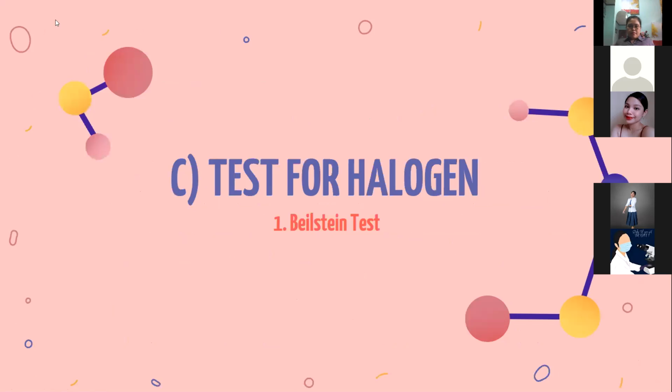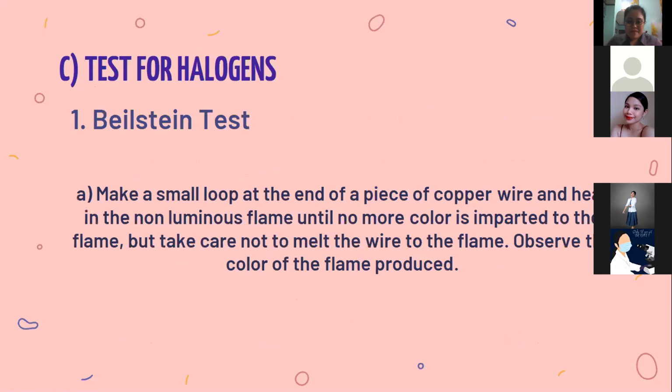Test for halogen. First is the Beilstein test. Make a small loop at the end of a piece of copper wire and heat in the non-luminous flame until no more color is imparted to the flame. But take care not to melt the wire. Observe the color of the flame produced.